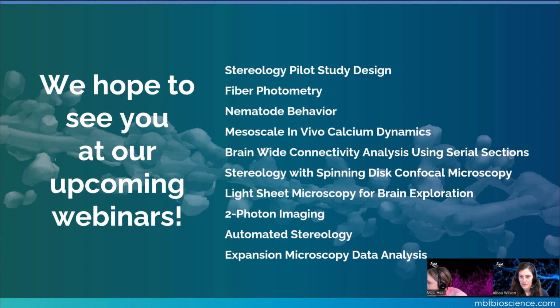We have a question about zooming in and out and handling the resolution, it sounds like, while you zoom in and out on the image to minimize computational burden. There's a feature that's somewhat recently been put into the software in the imaging panel. When you're in the 3D environment, there's an option called the visual density.